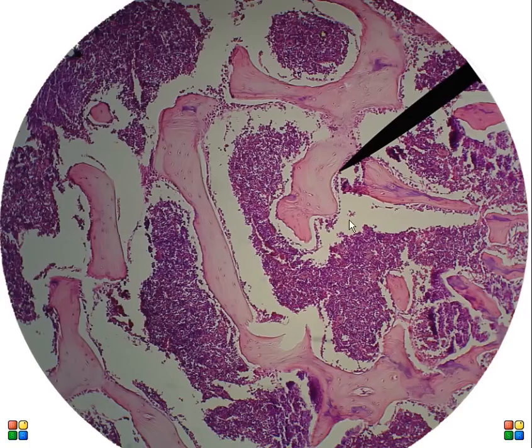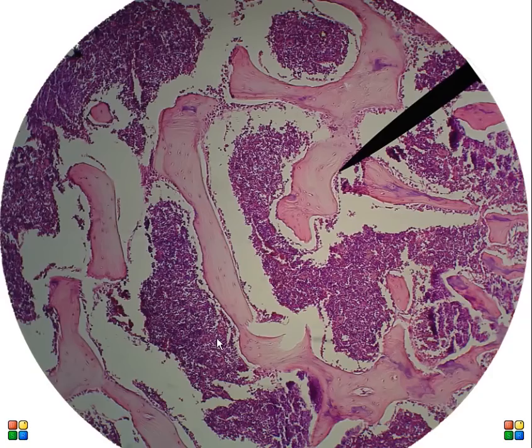Next slide, we have a picture at 100 times magnification of spongy bone. This is the bone tissue within the spongy bone. These are spicules of bone, or trabecular parts of the spongy bone. This is red bone marrow, and you can see some reddish spots in there indicating red cells forming. We can also see the little compartments — the lacuna or lacunae — inside of the bone tissue.